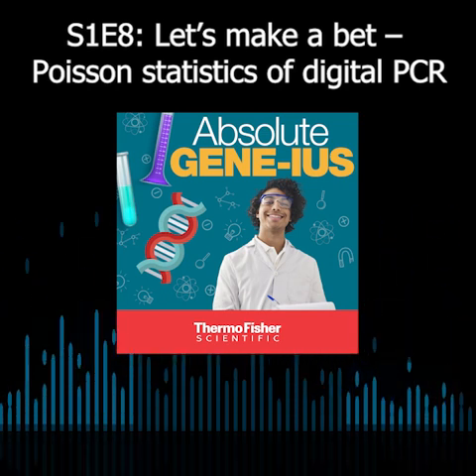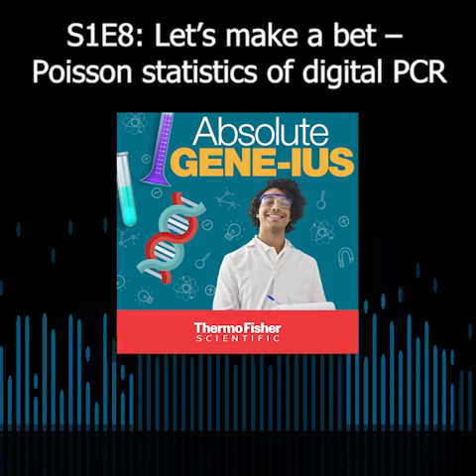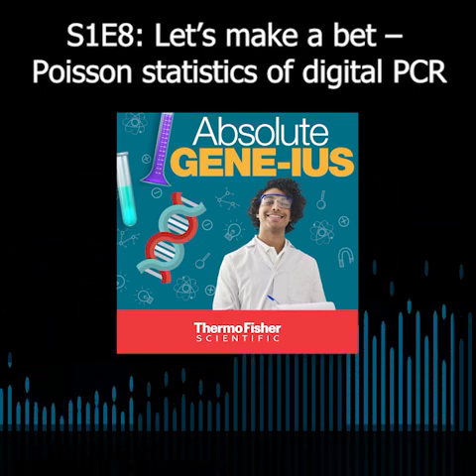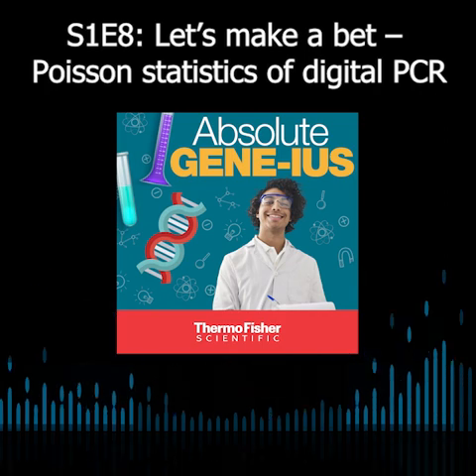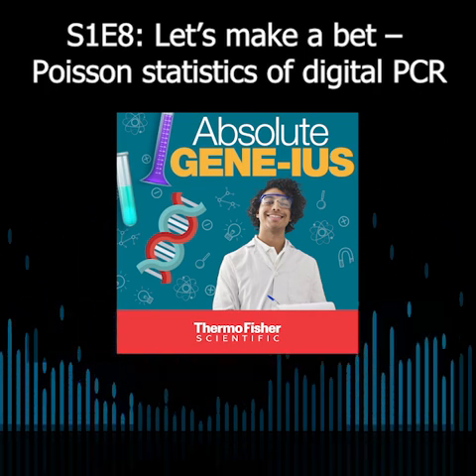And then you're dividing it up in the analysis to say which chambers had target and which didn't. And that's really where the digital comes from. You're classifying it as a yes, no, kind of a binary 1-0. That's how we classify each of those mini reactions.